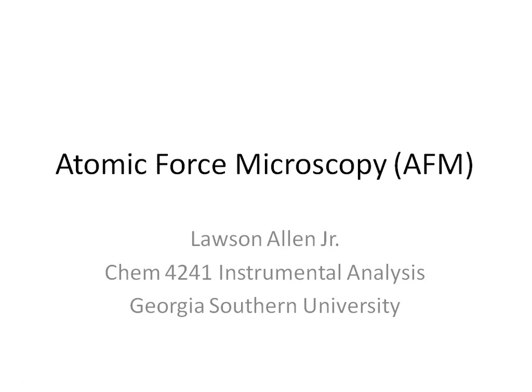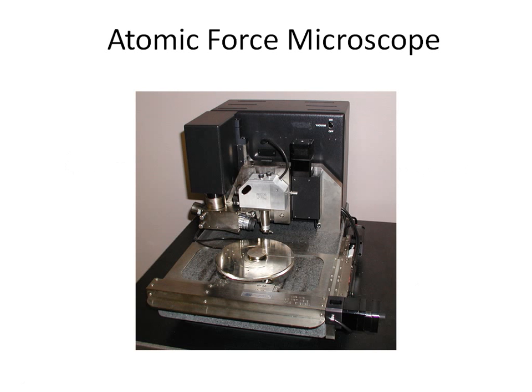Today I'm going to be talking about atomic force microscopy, or AFM, for my Chemistry 4241 instrumental analysis class. Right here I have a picture of an atomic force microscope. As you can see, it has many features that are familiar with other microscopes, but there's also some added features that make it a specific technique, and we'll go into that later in this video.